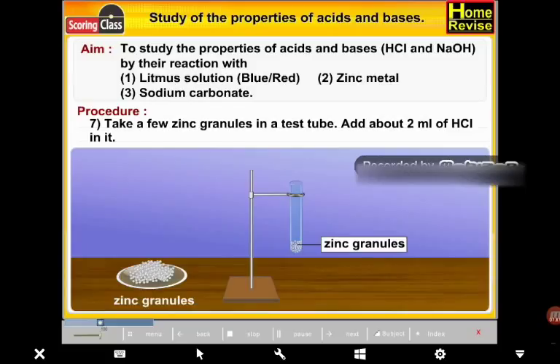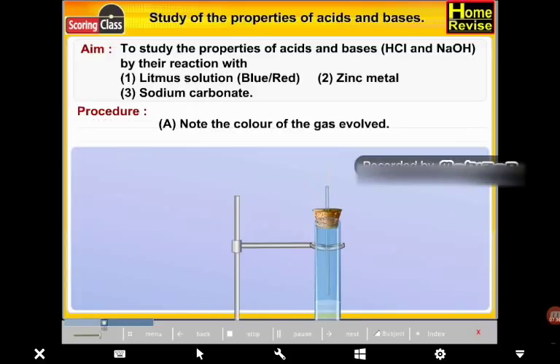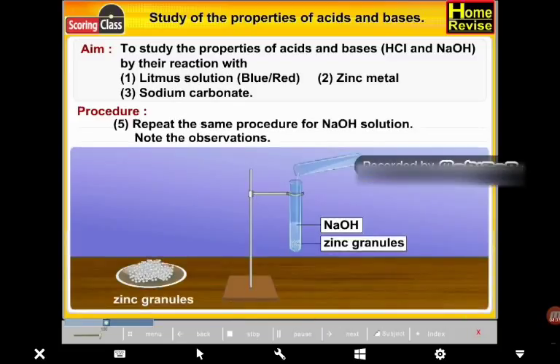Take a few zinc granules in a test tube. Add about 2 ml of HCl to it. Wait for about 5 minutes till the reaction starts. Take a cork fitted with a delivery tube and fit it to the test tube. (A) Note the color of the gas evolved. (B) Note the odor of the gas evolved. (C) Bring a burning candle near the mouth of the delivery tube. Repeat the same procedure for NaOH solution.